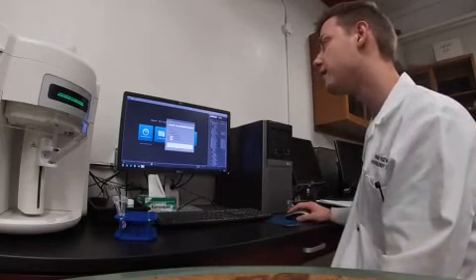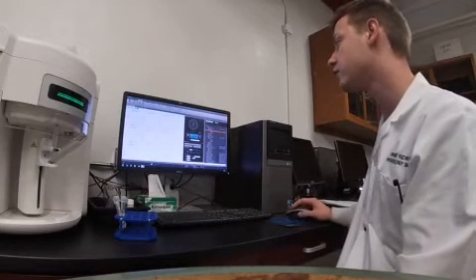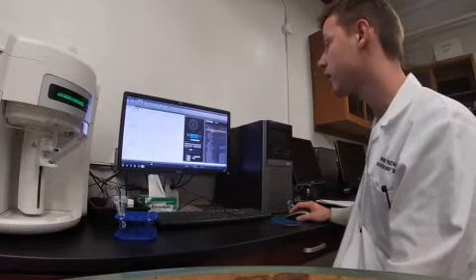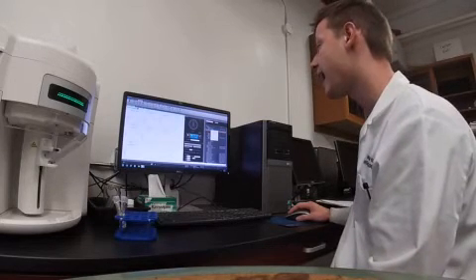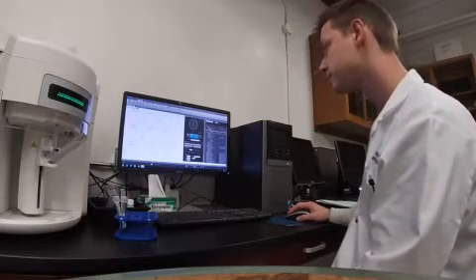Once you've done that, make sure it's selected to tube and labeled. You're going to go ahead and hit OK. You're going to be given a few different boxes over here. This is going to be kind of your main control hub, and this is where you're going to click to start the experiments. You can right-click at any time before or after you started or completed your experiment to rename each individual group.